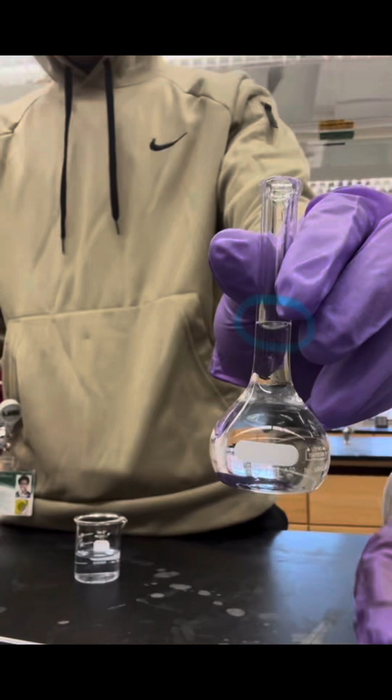A meniscus is the curved surface of a liquid in a container, like a test tube or a pipette, caused by the adhesive forces between the liquid and the surface of the container. It occurs because molecules of the liquid are attached to the container's walls, causing the liquid to either climb up or dip down, depending on the liquid's properties and the material of the container.